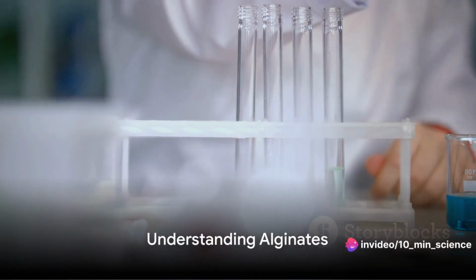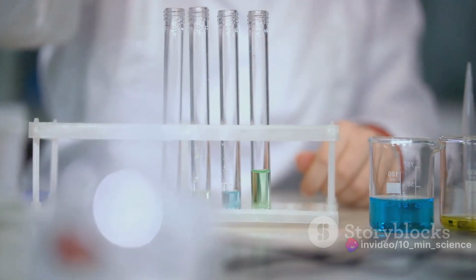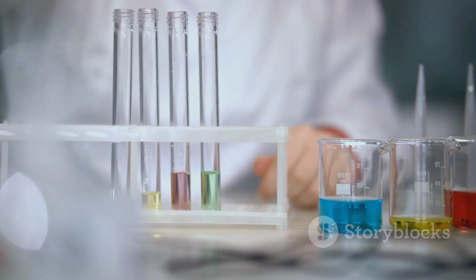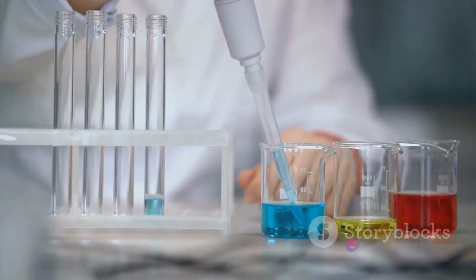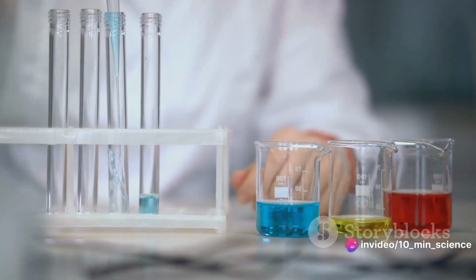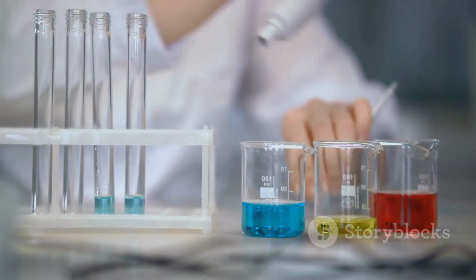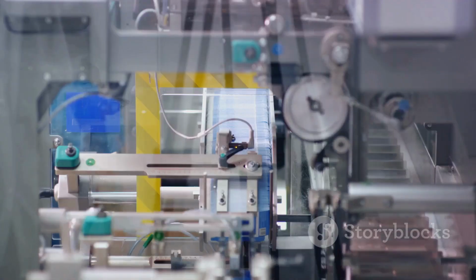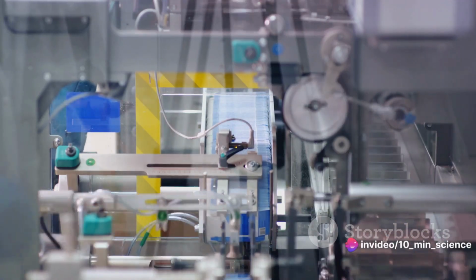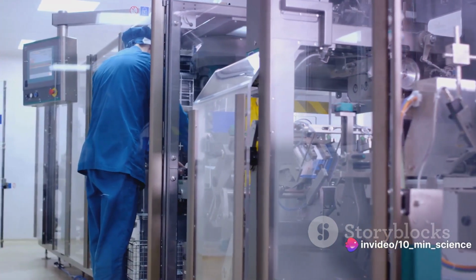To fully grasp the Alginates assay, one must first understand what alginates are. So, what are alginates? In simple terms, they are a group of complex carbohydrates, or polysaccharides, derived from brown seaweeds. This might seem like an unusual source, but nature has a knack for producing some of the most fascinating and useful compounds where we least expect them. Alginates have a unique property that makes them invaluable to the pharmaceutical industry. When mixed with water, they form a gel-like substance.